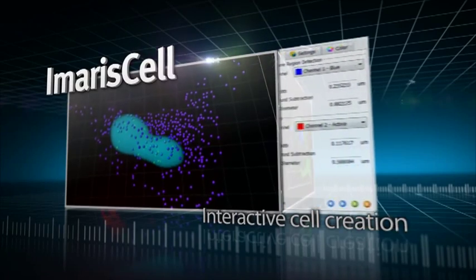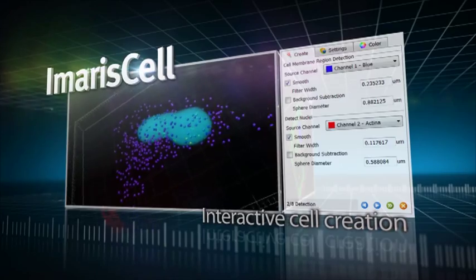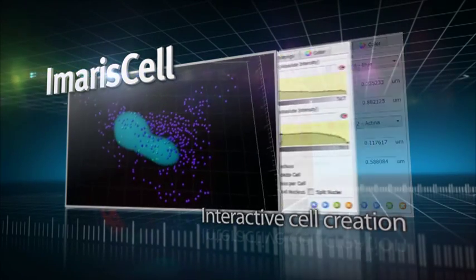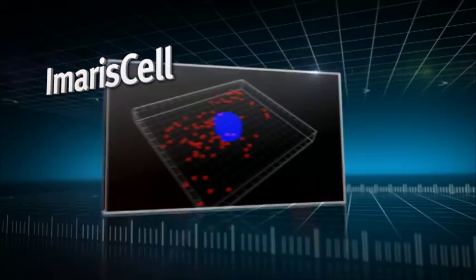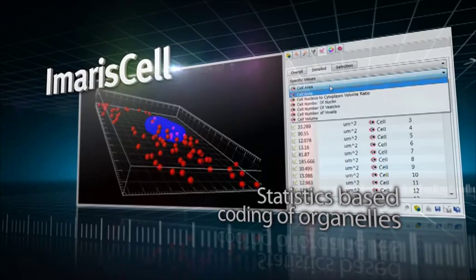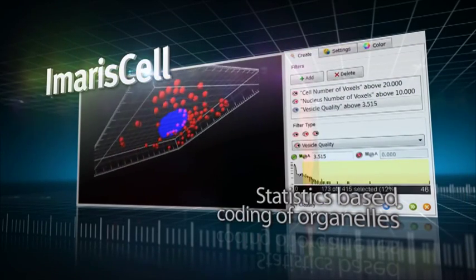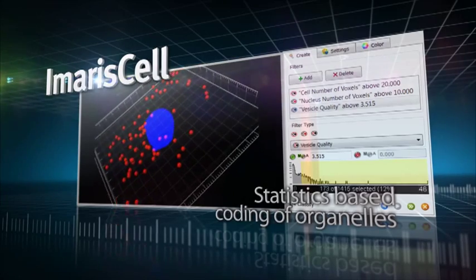Imaris Cell uses Bitplane's powerful image analysis algorithms and intuitive creation wizards to help you along the process of detection, display and editing of the cell's organelles. With Imaris Cell's advanced visualization of newly analyzed organelles, you can color code the nuclei and vesicles according to many statistical parameters, like volume, sphericity, distance from membrane and many more.